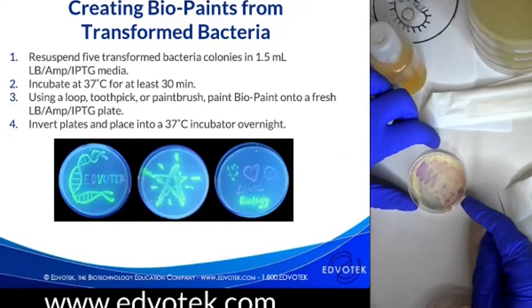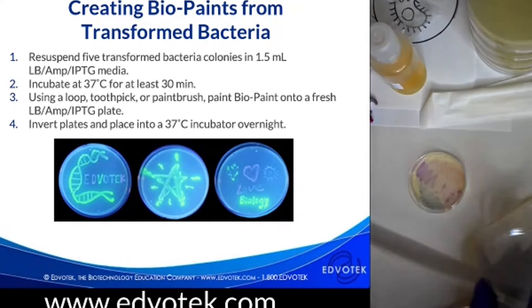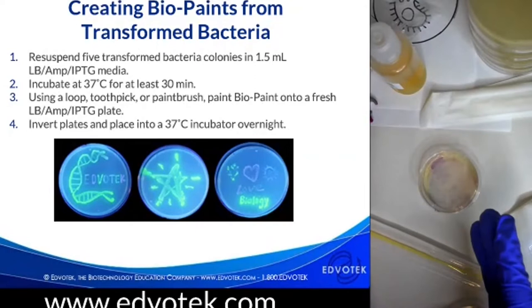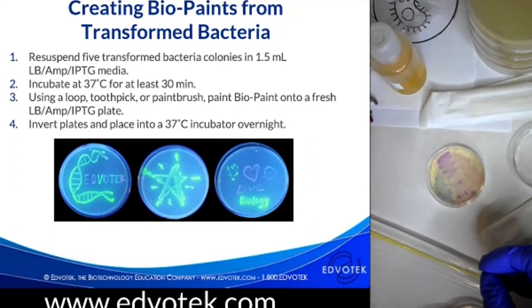So these are pre-transformed. And if I were to make biopaint from this, what I would do is scrape the bacteria off of the plate using a sterile loop. I have some disposable ones here. You could use a reusable one if that's what you had. We're going to resuspend at least 5 colonies in 1.5 mL of LB media, which has ampicillin and IPTG in it, because we want to make sure that we're not introducing contamination. Another thing our teachers wanted was to reduce contamination. So these plasmids all have amp resistance, so our media is amp resistant. If your students are painting on here for a long time, most of the crud that's floating around in your classroom will not get onto the plate and disrupt your results.